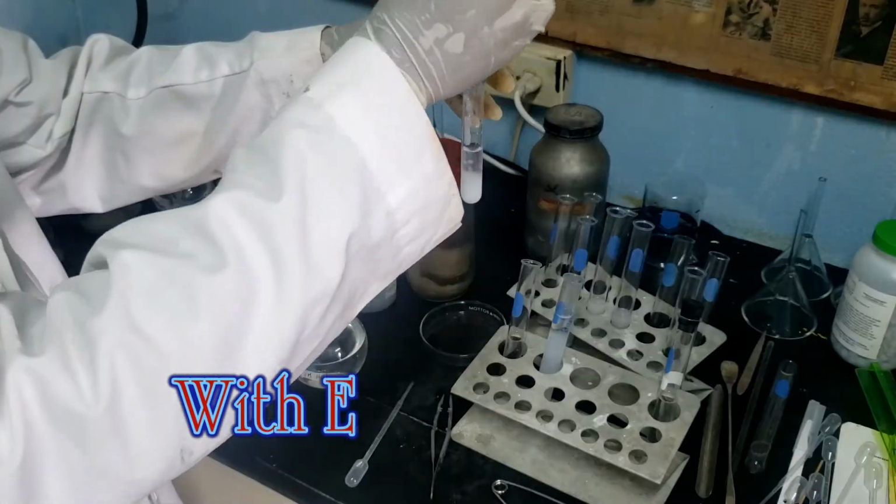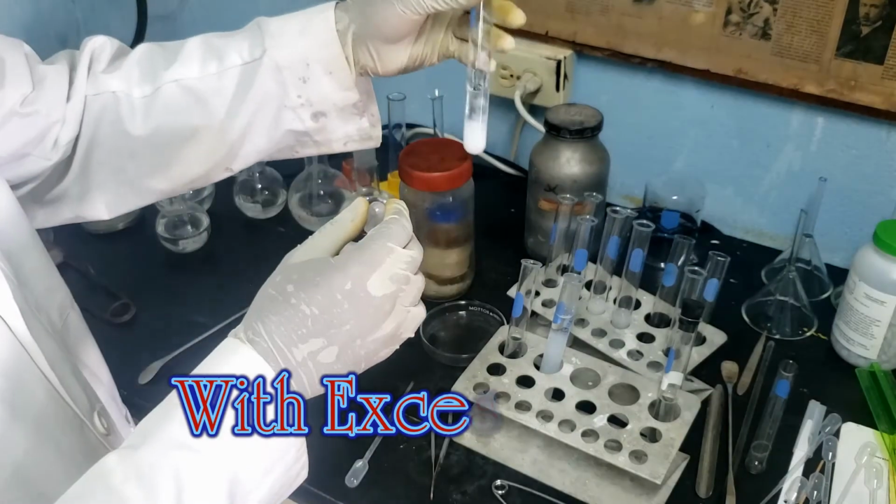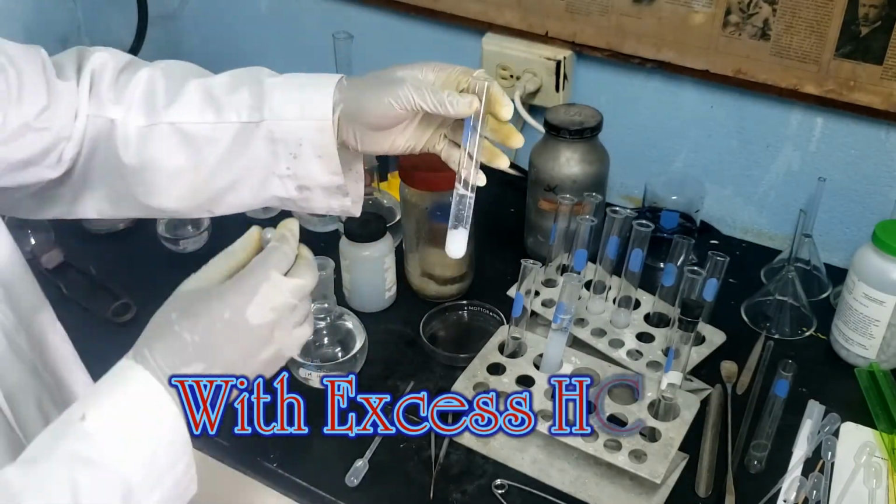In the final tube, the aluminum hydroxide is dissolved with hydrochloric acid.